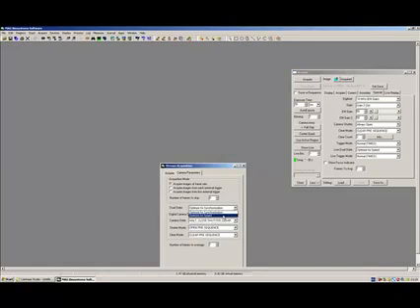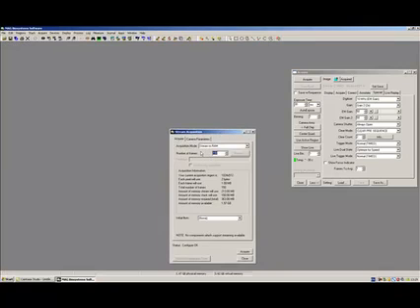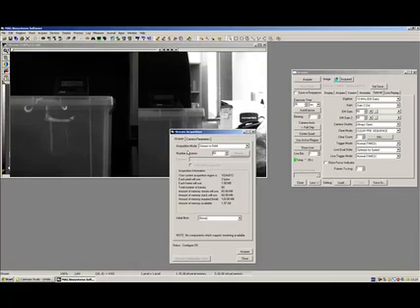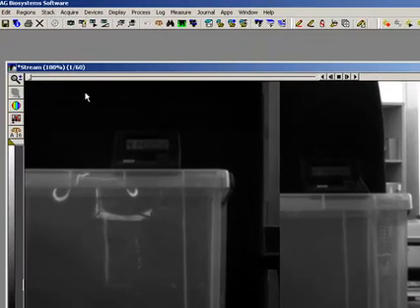Let's just come back very quickly and go optimize for speed, and this time let's just ask for 60 images, so just 2 seconds worth, and click acquire. There we go. And we can play through again, and if I come to about here on the video, you can see that this is set to 4:14:02:58, and I've got 4:14:02:58. So the cameras are pretty well synced together at the moment.